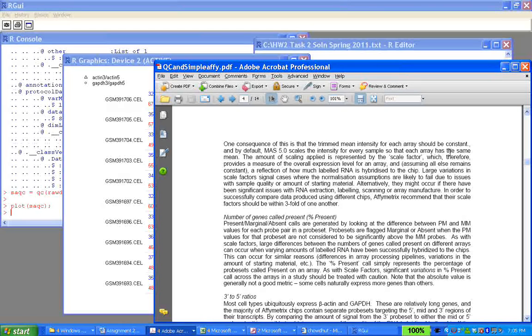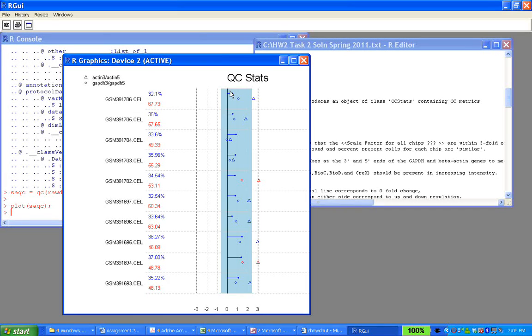And your first array, your trim mean was 5 because it was 1 to 10. So in your second array, when the trim mean was 15 and you divided it by 3, that's the scaling factor. Because of that division, your trim mean now became the same between your two arrays. So that's exactly what this particular thing is doing. The scale factor here is in half a fold.